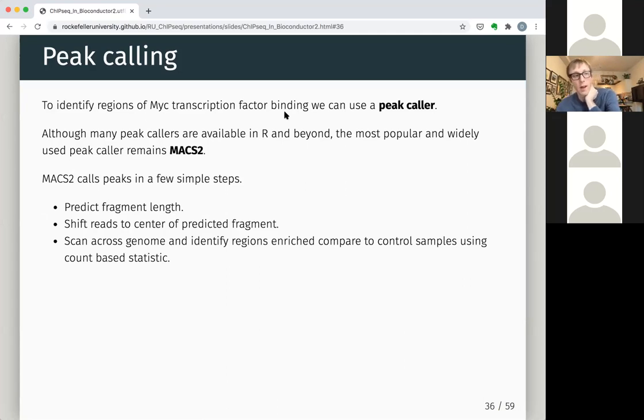Generally the way that I'll work is I'll start with MACS2, and then again, different peak callers have different strengths, whether you have sharp peaks or broad peaks, and all things have trade-offs. Generally the broad peak callers might be a little bit, I guess, less aggressive with how they call peaks. So you'll get more coverage across the genome of peaks, and you might pick up your broad regions, but you might call peaks in areas that actually don't look very peaky.